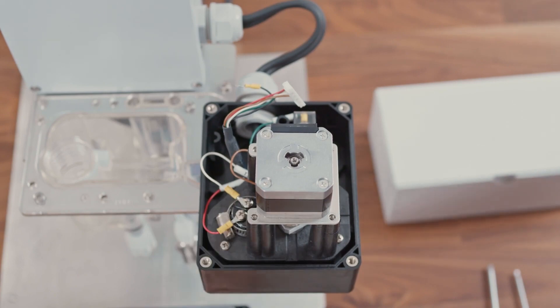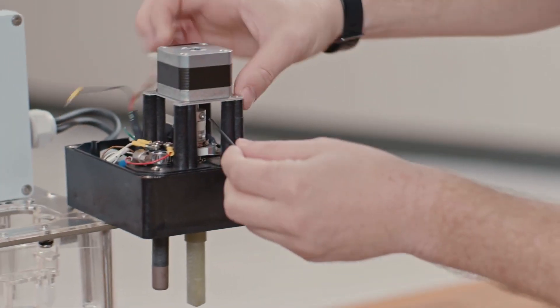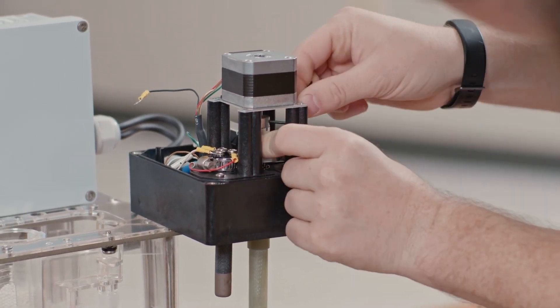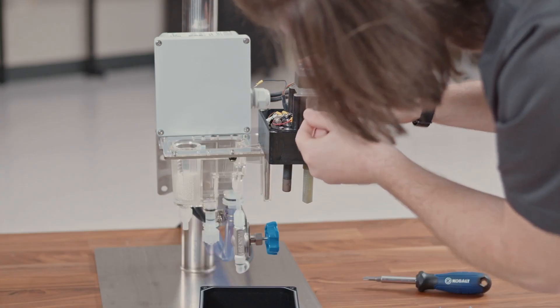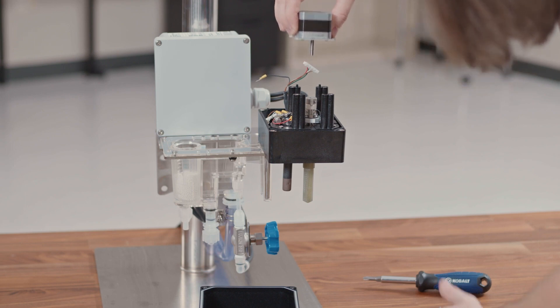You can then loosen the allen bolts with the two millimeter allen wrench that are part of the coupler. This is the two metal discs with the plastic disc in between. Loosening these will allow the drive shafts to be removed. With the screws removed, you can lift the motor straight up, being careful to keep the motor coupler pieces together.